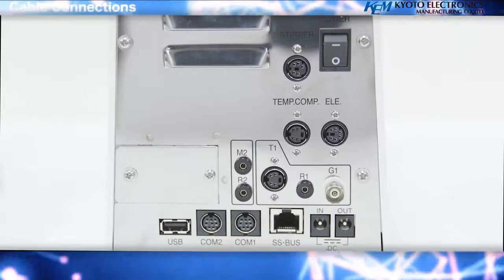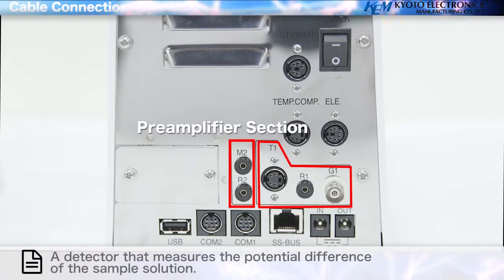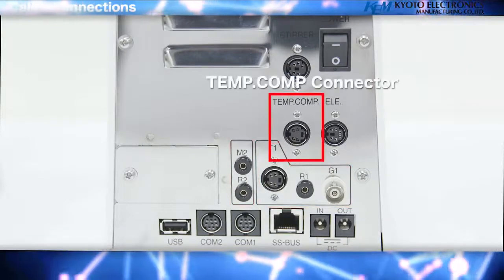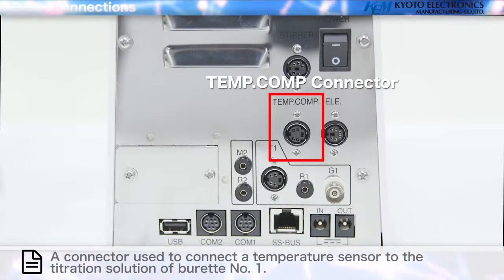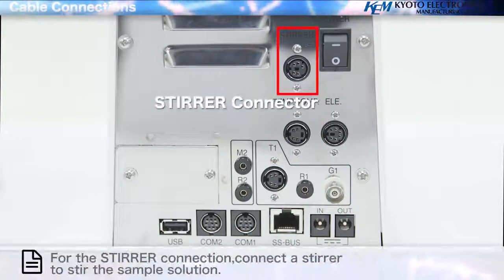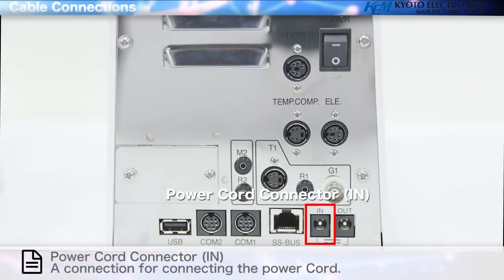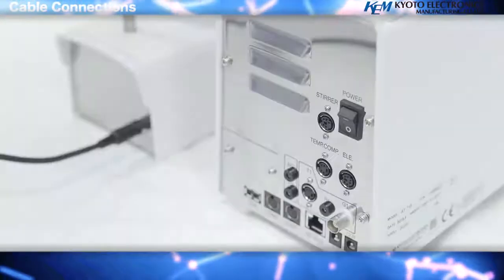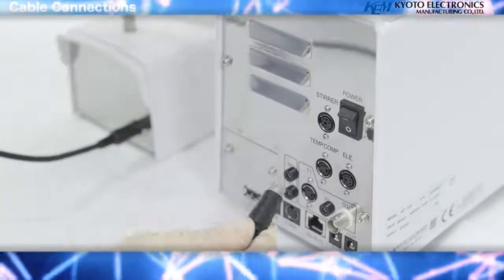Cable connections and description of each part. Pre-amplifier section: Detector 1 is a detector that measures the potential difference of the sample solution. Temp.com connector is used to connect a temperature sensor to the titration solution of burette number 1. The stir connection is used to connect a stirrer to stir the sample solution. Power cord connector In is a connection for the power cord. Power cord connector Out is a connection for connecting the power cord of the MCU-710. Connect the magnetic stirrer to stir the sample solution.